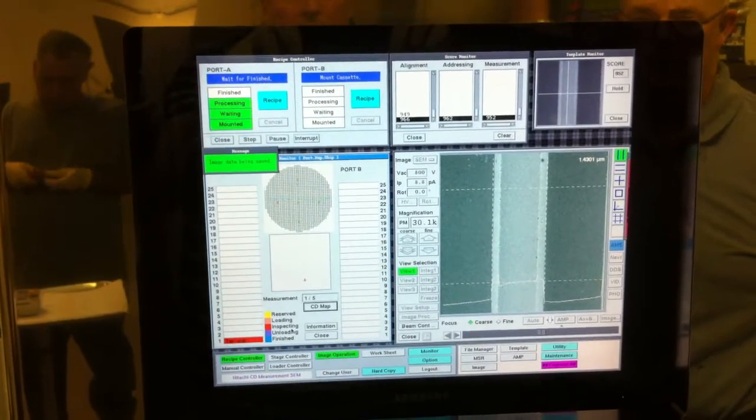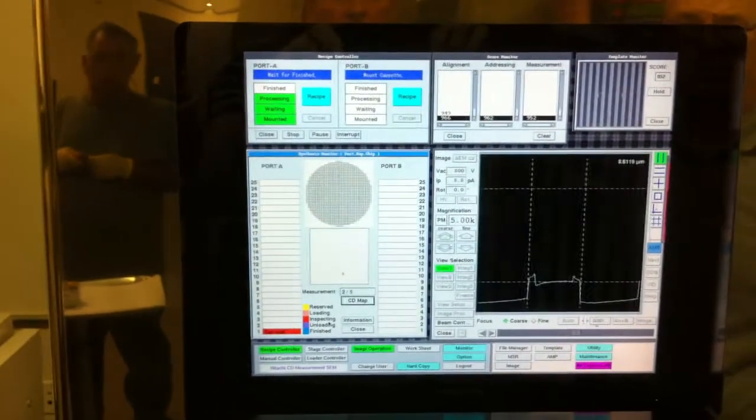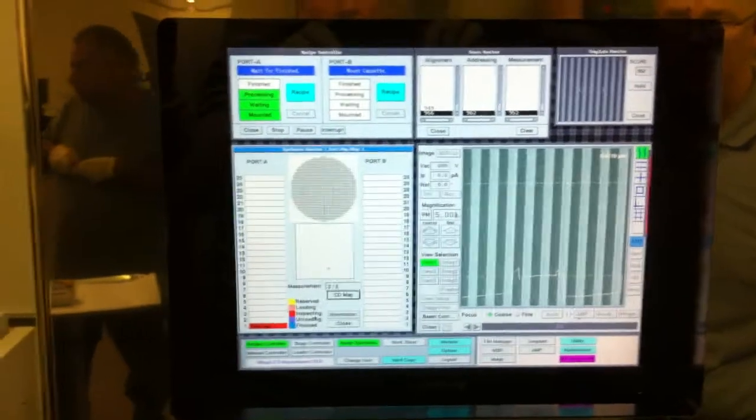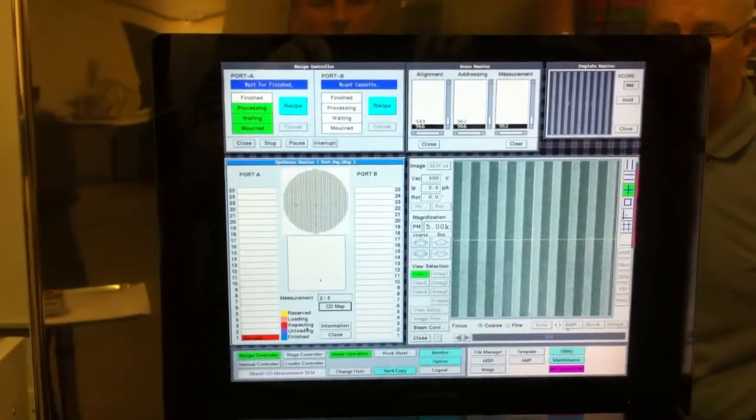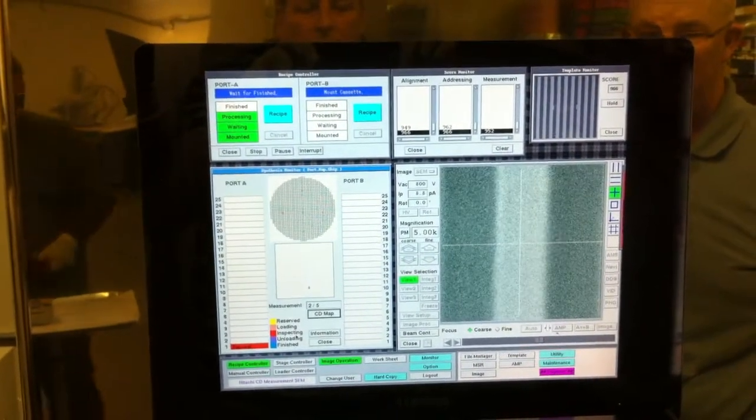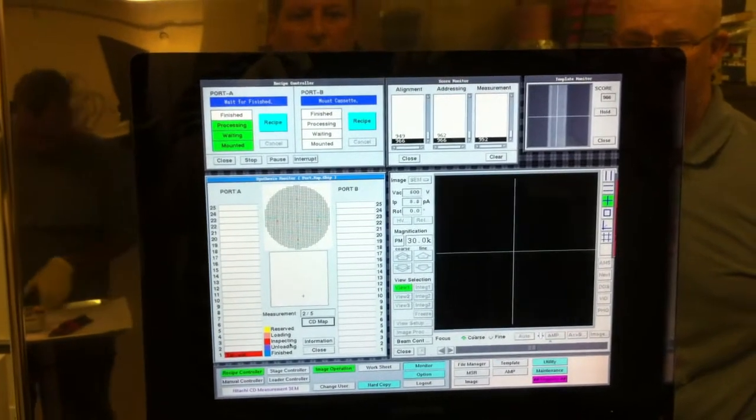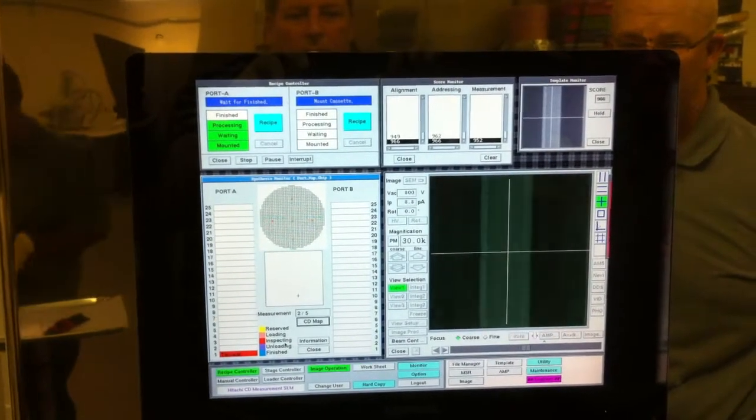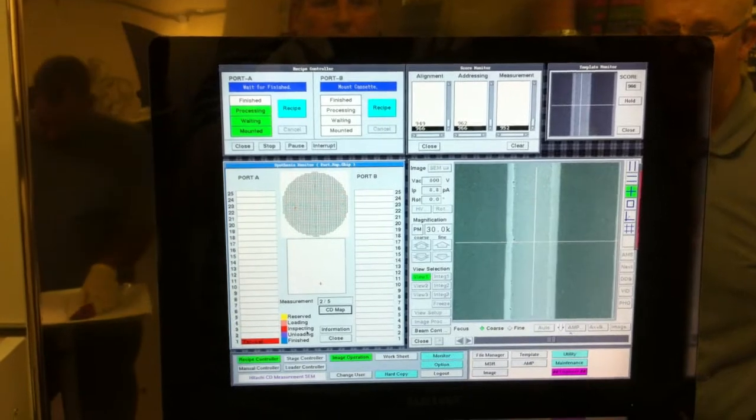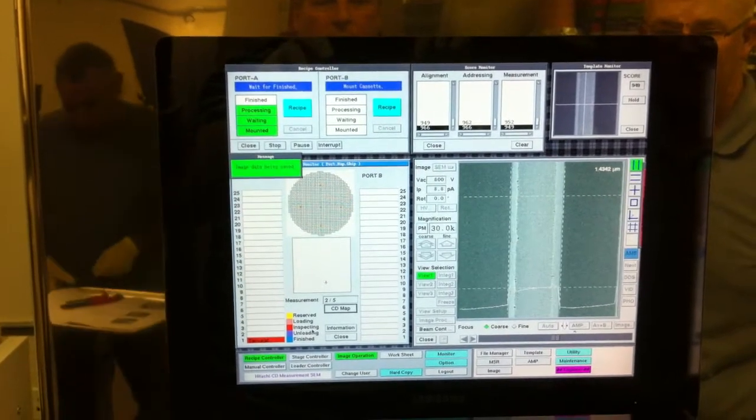It moves on to site number two, uses a pattern rack, selects the feature, does a quick autofocus, integrates, and another measurement done.